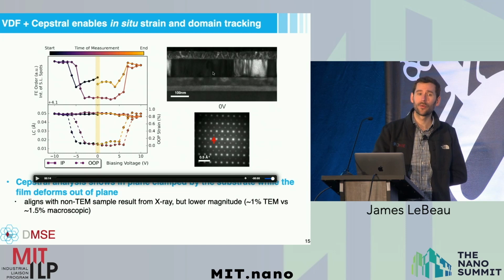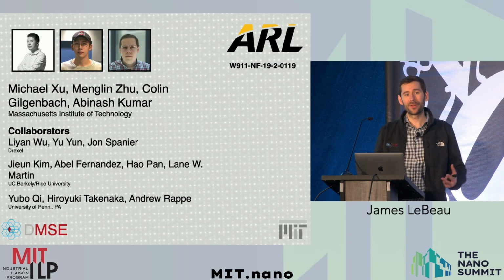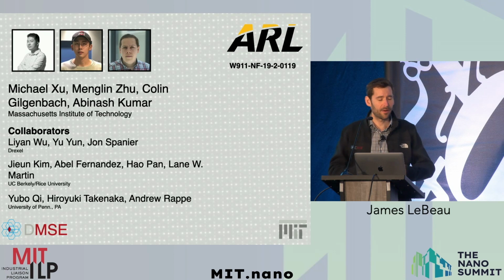So that's just a brief overview of how we use electron microscopes to get deep insights into the behavior of functional materials. Here I've focused on antiferroelectrics, but these can be applied to everything from metals to semiconductors to insulators. These techniques are universal and can provide deep insights into materials properties.